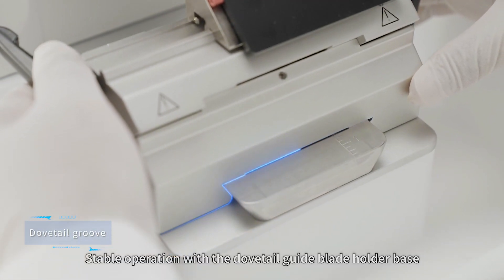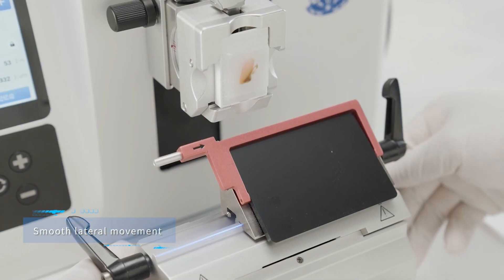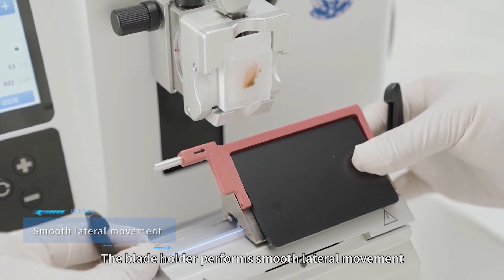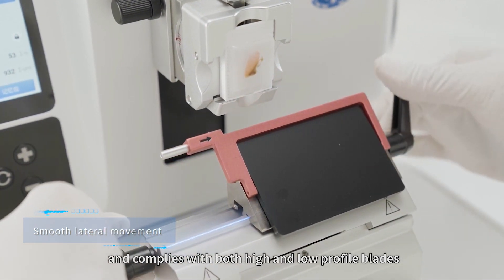Stable operation is ensured with the Dovetail Guide blade holder base. The blade holder performs smooth lateral movement and complies with both high and low profile plates.